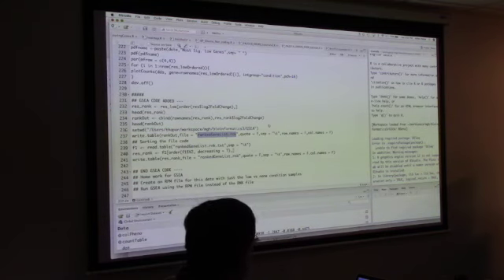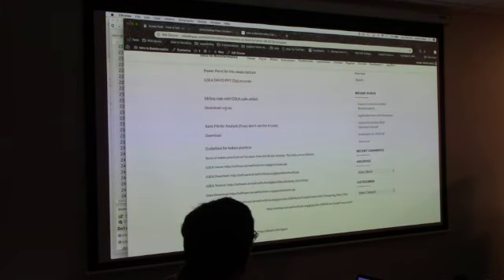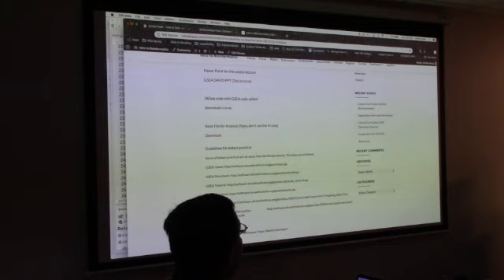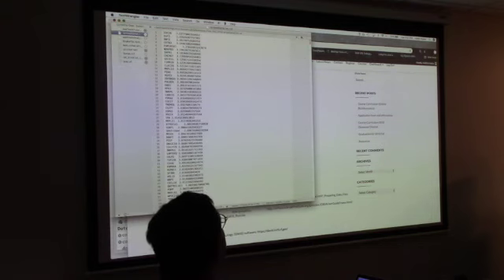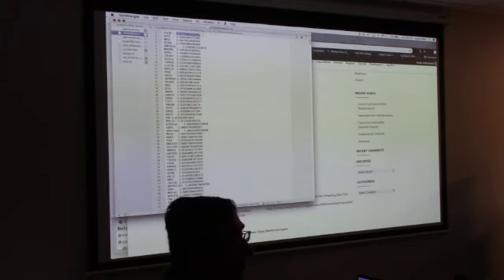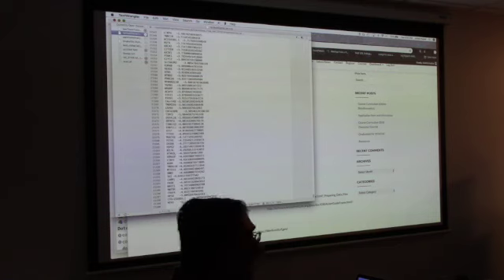Now, this ranked file is, first of all, this is the R file. This is your ranked file, which is the output of this. Okay? So it's going to look something like this. You have your gene name and you have your fold change. Right? And this has all your genes. So it's a pretty big file, but that's expected. This has about 20,000, 21,000 rows, which is what we expect. We want this to have this many, because this is your entire data set. This is what you're going to put in as your file.